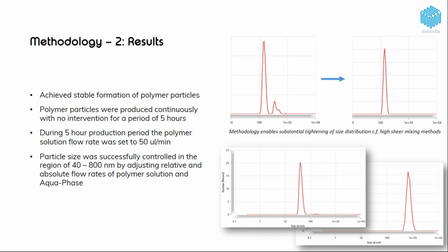The reason for this is if you get a little bit of collection of the polymer on the sides of the channel, despite the protection, the high pressure tends to shift that through straight away, and you never get any problems with clogging.